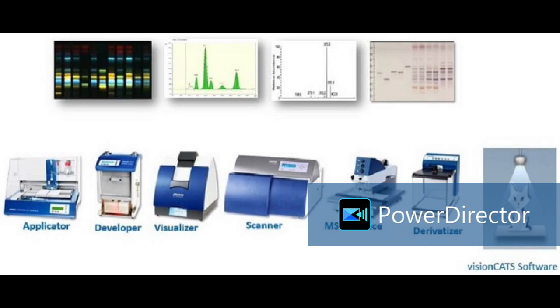Any machine will not do any magic. If the analyte is present in your sample aliquot, then only it will show. If it is not there, your sample extraction procedure is wrong. If some decomposition or deterioration of the structure of the analyte happened, then the machine will not show you anything. After taking the final aliquot for HPTLC analysis, just select a suitable stationary phase.